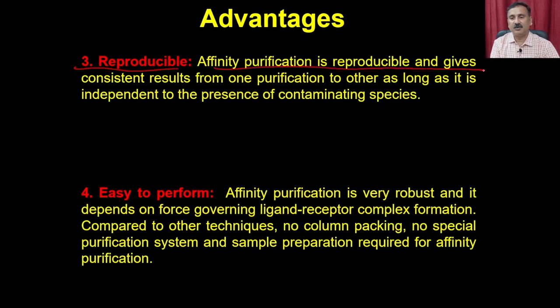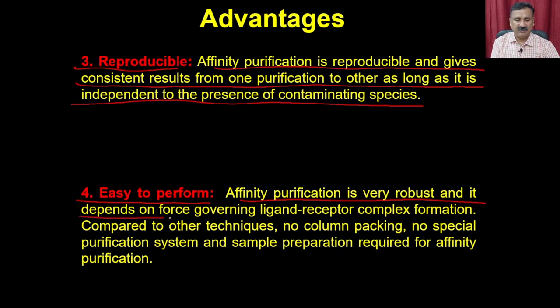Affinity purification is reproducible and it gives a consistent result from one purification to another, as long as it is independent of the presence of contaminating species. Then it is easy to perform. Affinity chromatography is very robust and it depends on the forces governing the ligand-receptor complex formation.